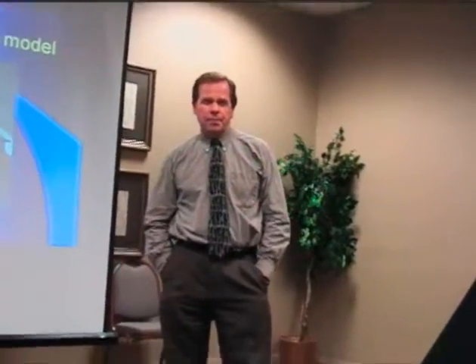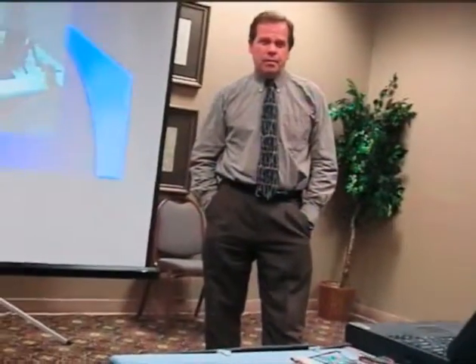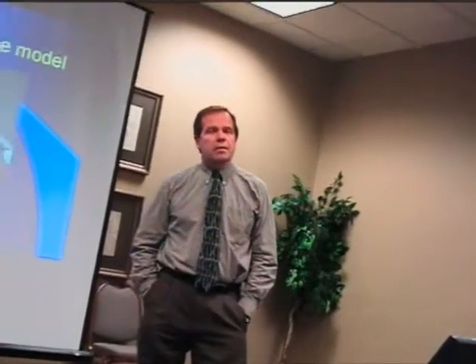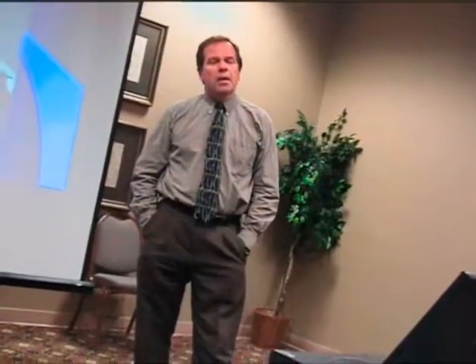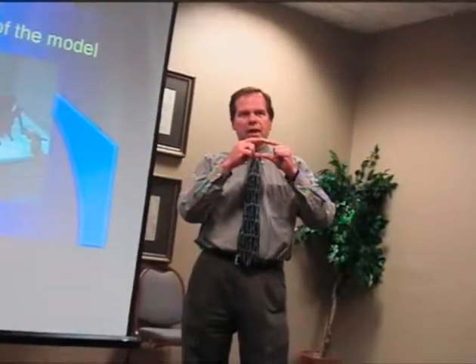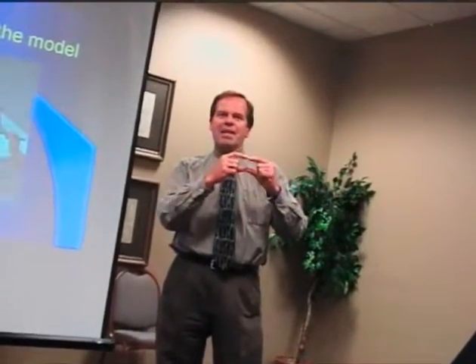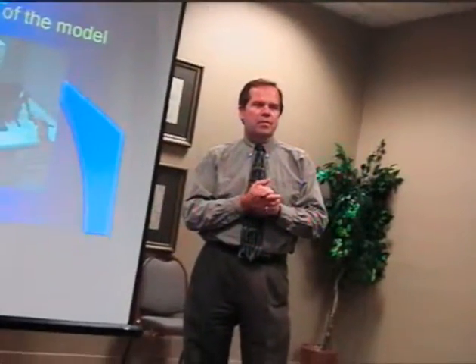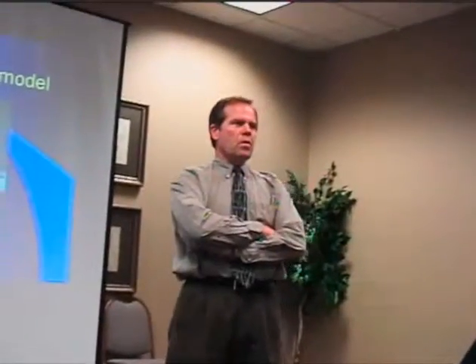This would presumably, if you pick up the element, let you tell the difference between cobalt and alumina. Yes. And so you could model a cobalt particle in an alumina sample. Yes, and I think that's where the real value is here. I was excited to see that we could see the iron in the nanotube, and I was extrapolating that to say, oh yeah, we could see cobalt in a catalyst particle. If you take that a bit further with various promoters, you can see exactly where the promoters are. Where did the promoter go? Yeah, where is it in the structure?